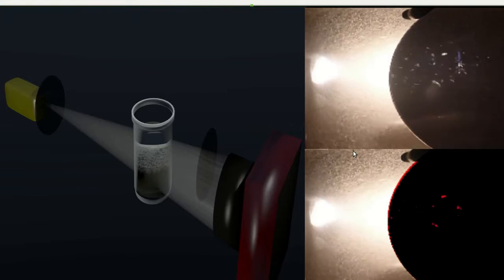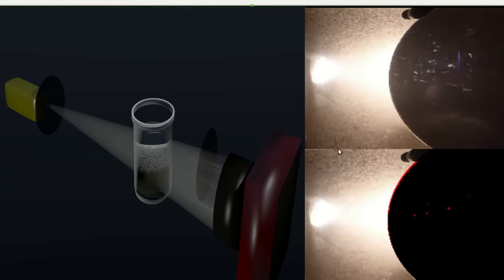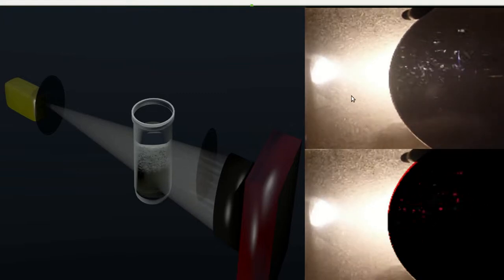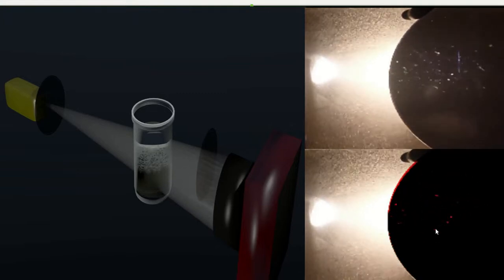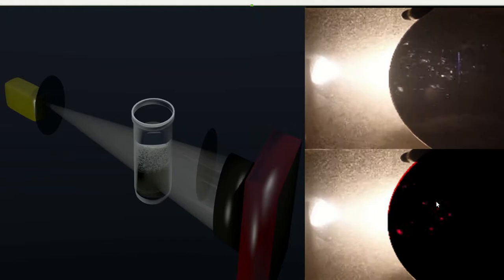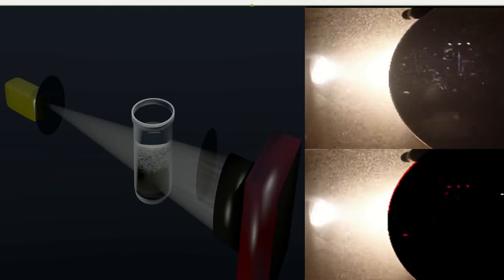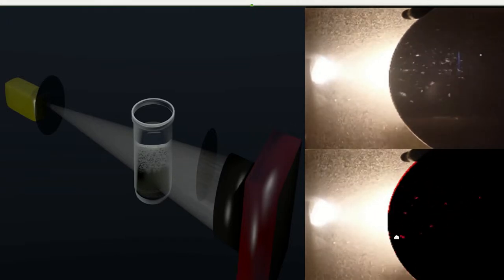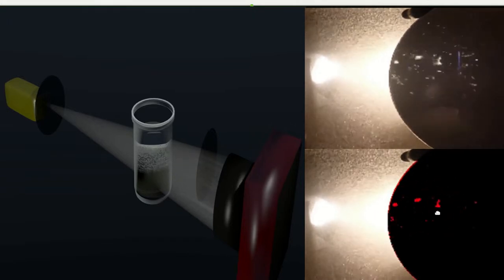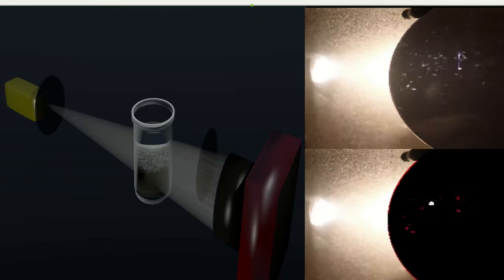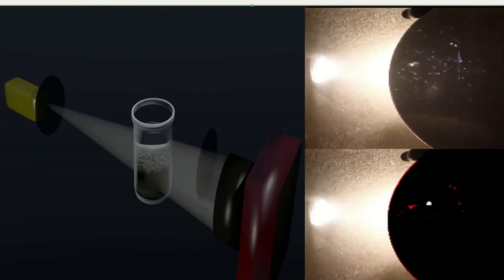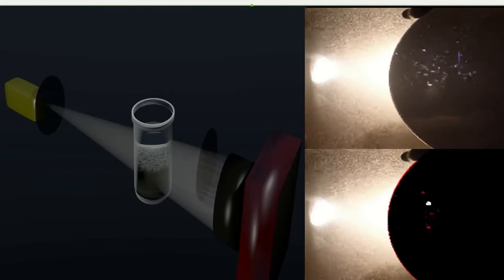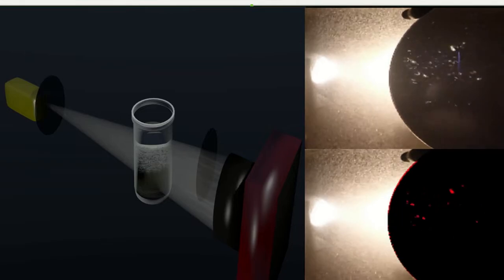The image on the bottom is simply a processed image of the top which has been thresholded. This demonstrates that a computer can be used to objectively analyze the video in which we could pick out the API shape, the size, or the concentration.